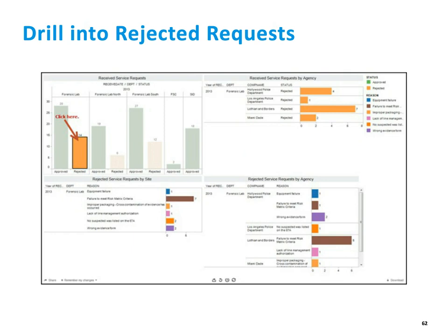Okay, so that's the point of the business intelligence, is it's not static. You can look at your data in ways that make sense to you. Maybe it's a map of your state, maybe city by city. You can look at drug trends, et cetera. But if the data is in your system, you should be able to have these dashboards that let you analyze your data and make informed decisions.